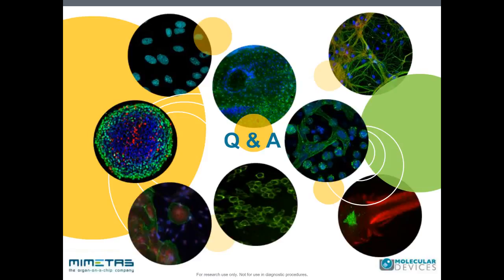Okay, thank you. Another question I have is, Jos, when you say 3D image analysis, are you doing analysis on the reconstituted volume to extract the volume measurements? That's correct. And also there, it depends on the application. Sometimes it's sufficient just to do a max projection of the image stack and basically look at the image. But in many cases, we analyze the volume and use that in a more or less automated setup to quantify the signals inside that volume rather than doing it on a max projection or a flat projection of the image.